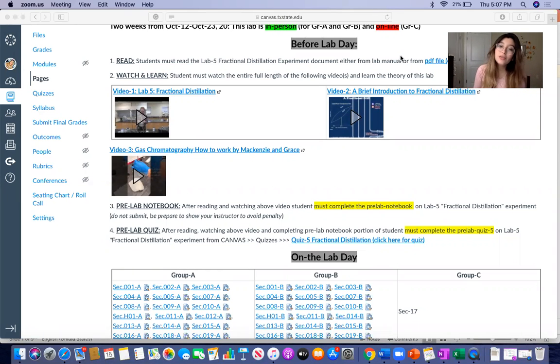Hello everybody, this is going to be your pre-lab lecture for fractional distillation.